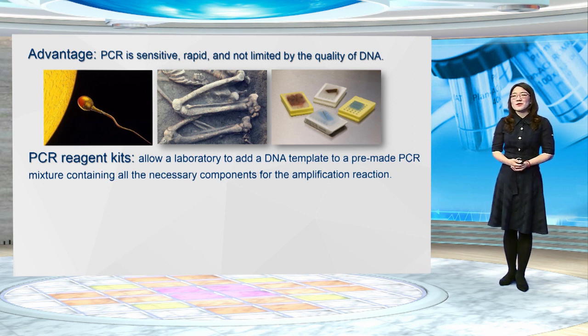The kits are typically prepared so that a user adds the liquid of the kit solution to a particular amount of genomic DNA. The best results are obtained if the DNA template is added in an amount corresponding to the concentration range designed for the kit.